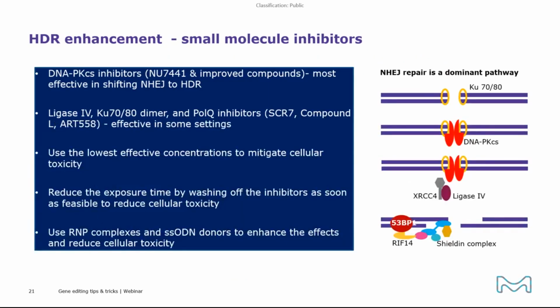You can enhance HDR editing efficiency by using small molecule inhibitors to NHEJ repair proteins, especially the inhibitors to the DNA-dependent protein kinase catalytic subunit.